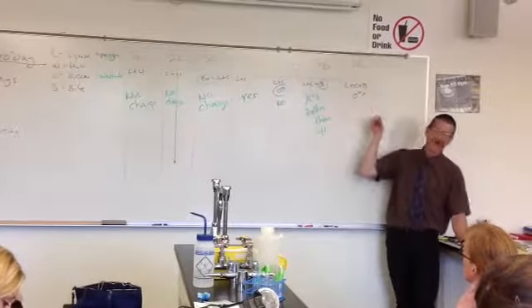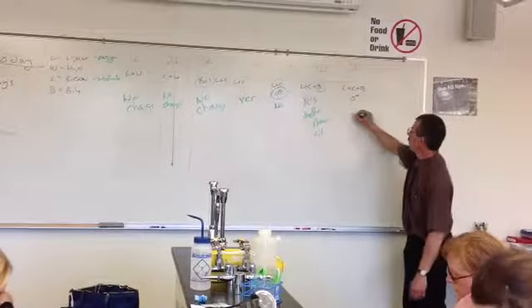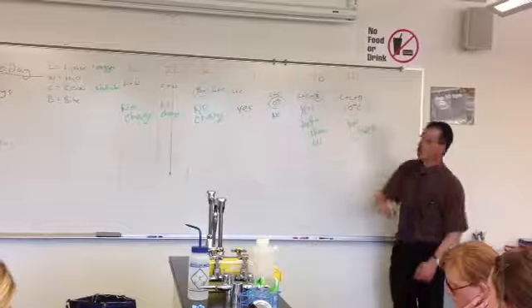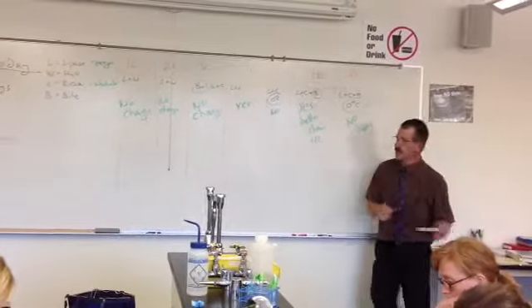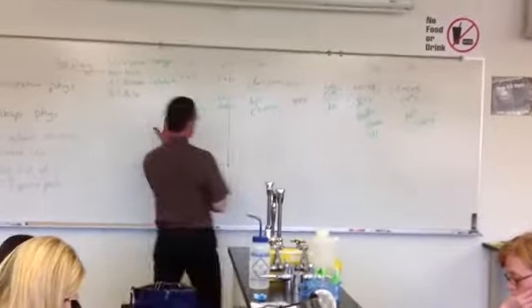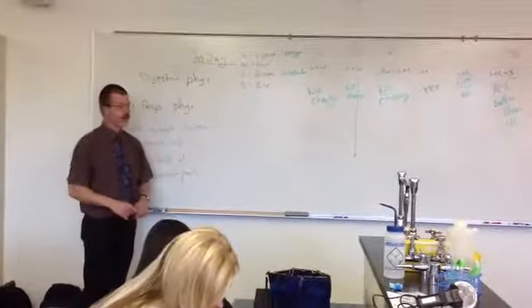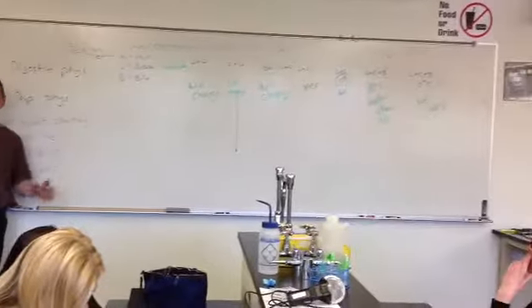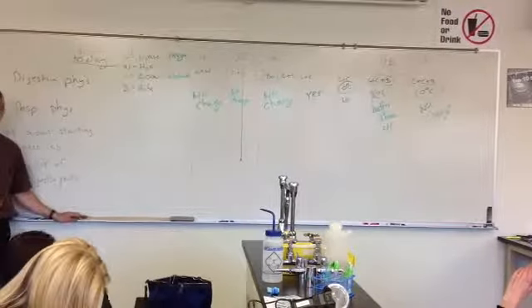So tell me about 5B. What do you expect to happen or what happened? Nothing? We have bile. What's wrong with 5B? Too cold. Again, too cold. If you remember your basic 112, you have to have an enzyme and a substrate at the right temperature to work. Bile makes it faster because the soap helps it along. So if you understand that chart, that's what you're supposed to get out of the hour of your life you spent with test tubes. Make sense? Biology 112 review.